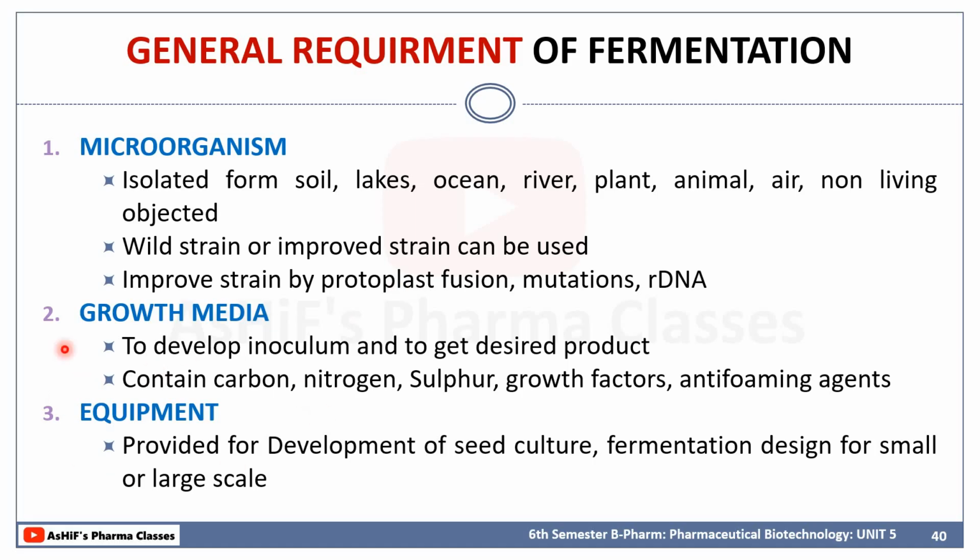And then finally we require an equipment which is known as fermenter or bioreactor, which will provide for the development of seed culture, fermentation, design of small or large scale production. These are the general requirements of the fermentation. Anyhow, we will discuss the three general requirements in detail in further topics.